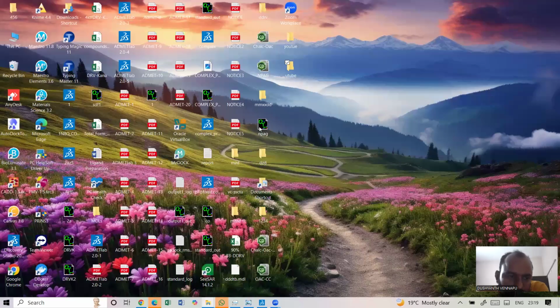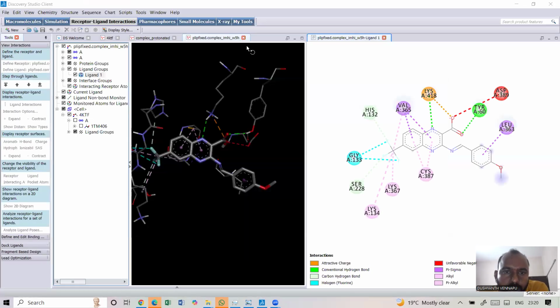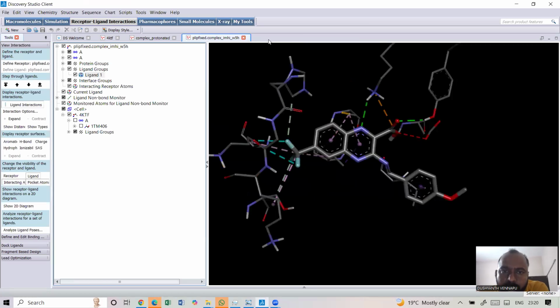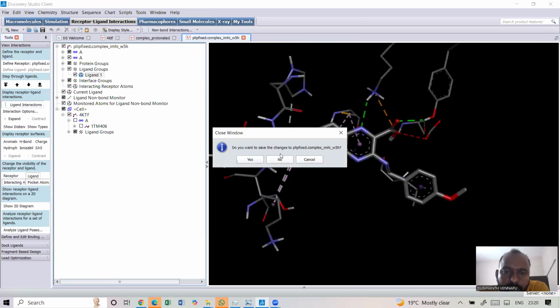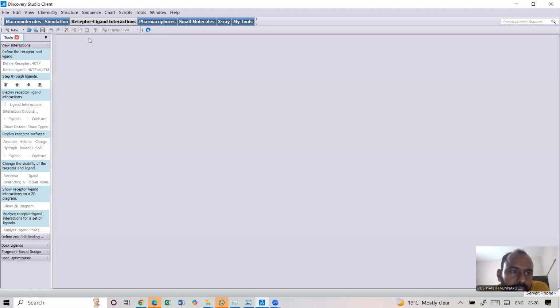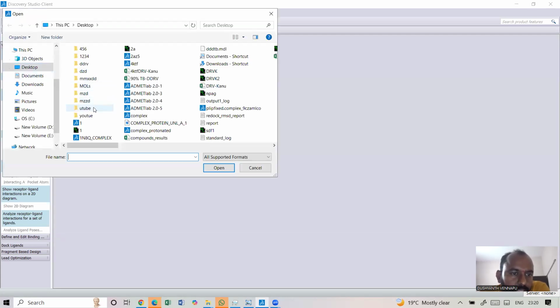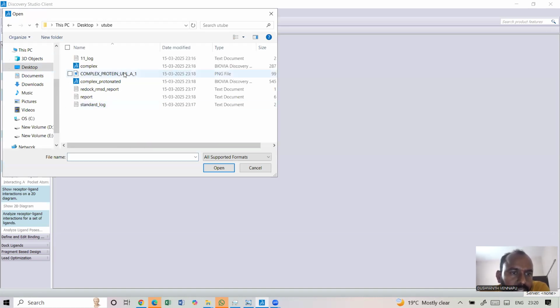You just have to go to the third party software, that is Discovery Studio, and just open, sorry, let me close all these which I have been performing in my last research. So I am stopping all these things. I'll just present you the current data. Just I'll click on open, and I'll go to the folder which I have already prepared, and simply I'll click on complex protonated, and I'll just click OK.